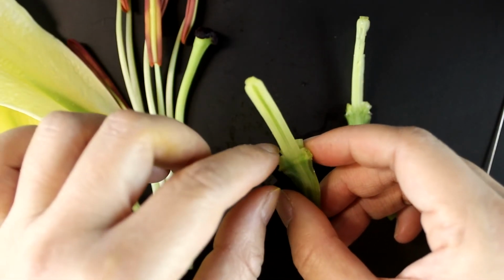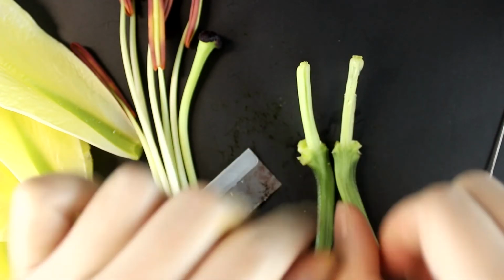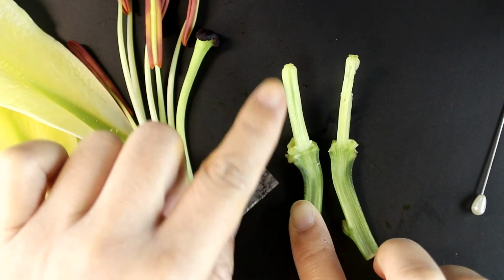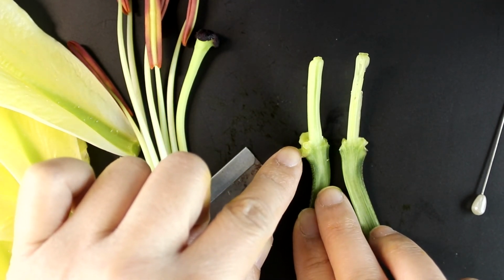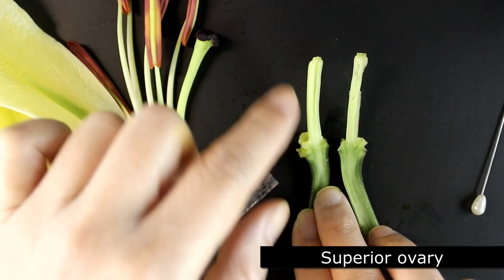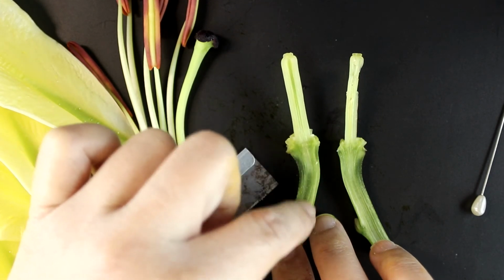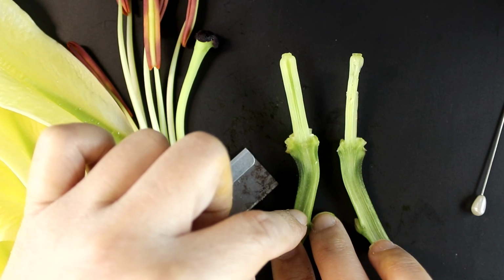So how can we describe the position of the ovary? As the ovary has been cut longitudinally, you can find its position clearly relative to the attachment point of other floral parts. You can see that the ovary is above the attachment point, so it is a superior ovary. If you find the ovary embedded here, below the attachment point, then the ovary should be inferior.